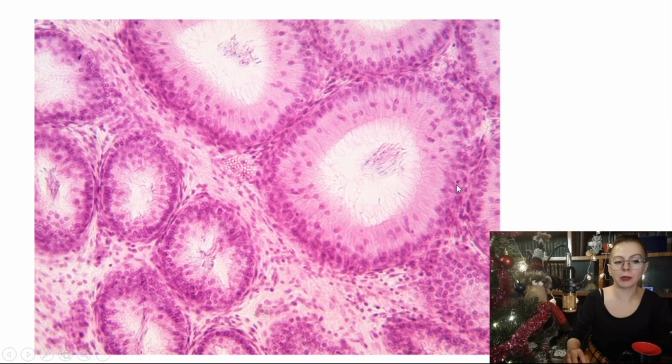Besides, here another epididymis is shown, and it is very confusing with the testis. One might suspect that this is the spermatogenic epithelium, but no, we can see giant stereocilia, and spermatozoa are in the center. There is a distance between epithelial cells and spermatozoa. There is a distance. So this is the epididymis, not the testis.